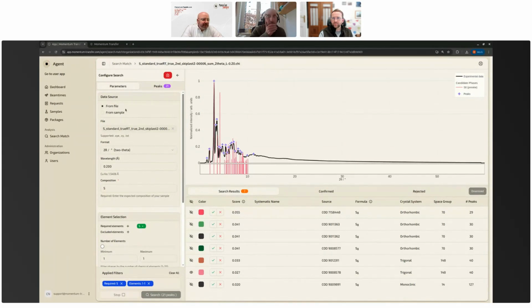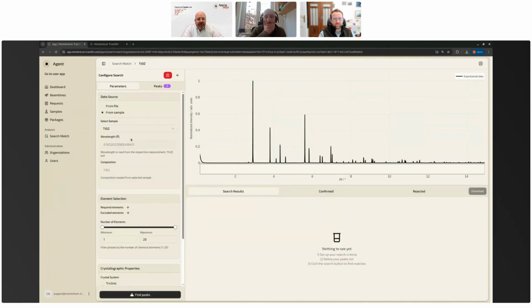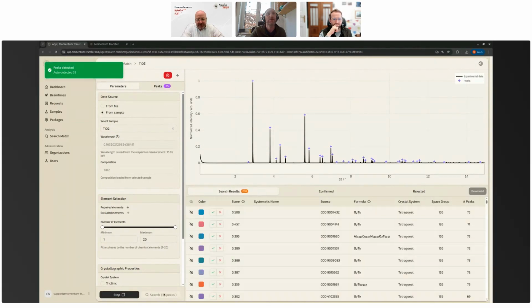There is one question. How can we know the CIF number? I think that's what NO CIF number. Yeah, so the CIF number, I presume you mean with respect to the COD number of the entry. You don't need to know that. It actually plots it in the outputs. So if I just run this again quickly, I can show you.